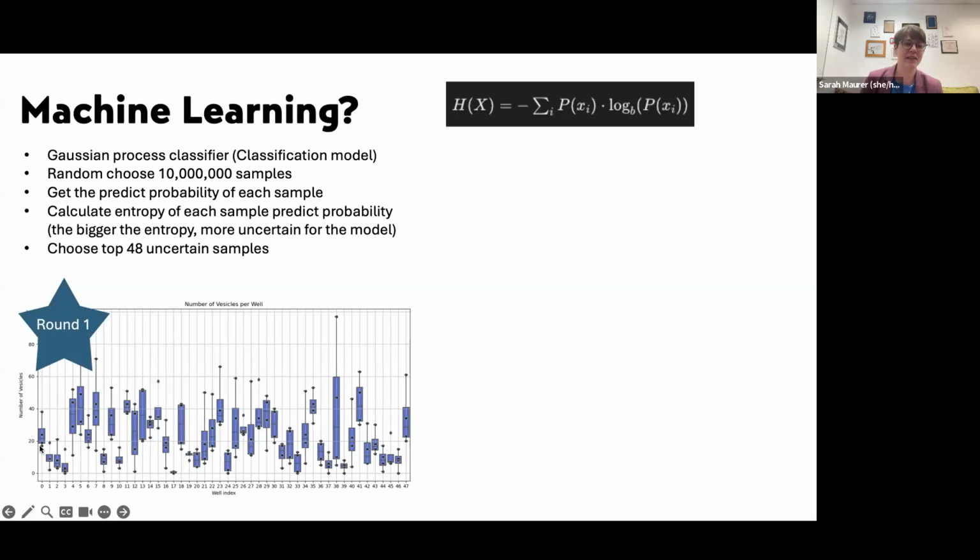We're doing them in quadruplicate because there's a little bit of variation in how you rehydrate the samples and how many vesicles you find. And so we found that having more than duplicate was important. But yeah, there was only one sample in round 1 without vesicles. So I think we did very well, but it's problematic if you're trying to learn where vesicles form and they form everywhere.